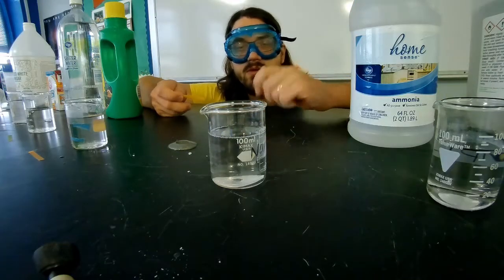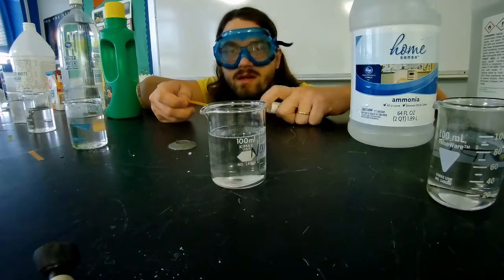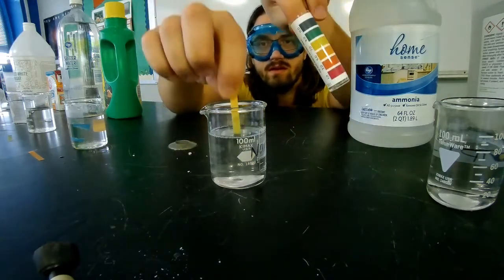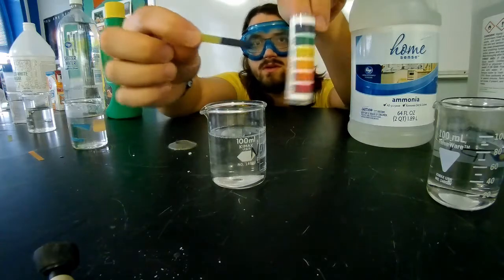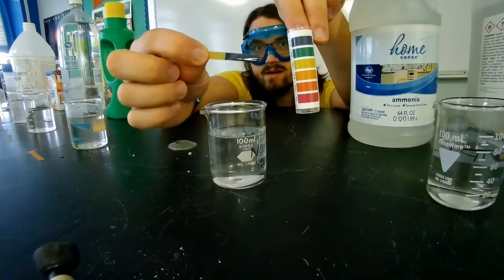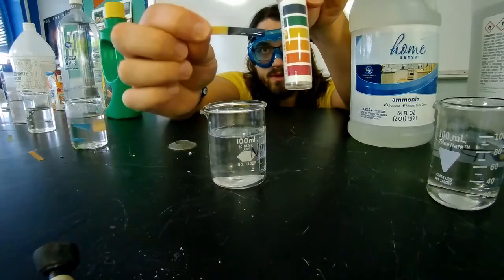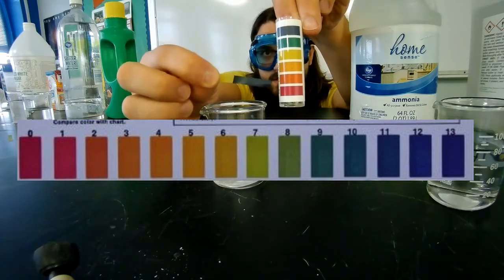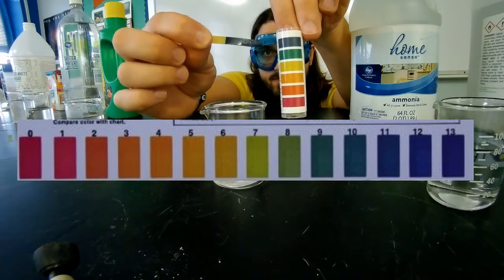Alright, the super smelly one. This is ammonia. What do we think? Let's see what happens. Dunk it. Whoa. That's a really strong reaction there. So let's see, what do we think? Acid or a base? Write down the pH as well.